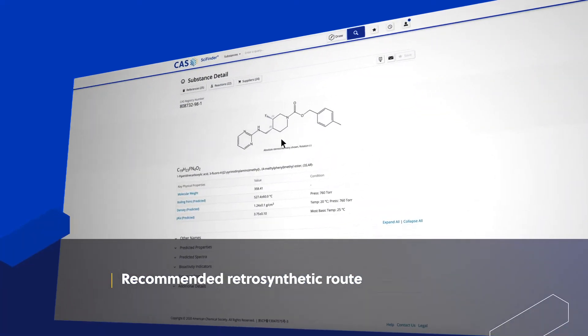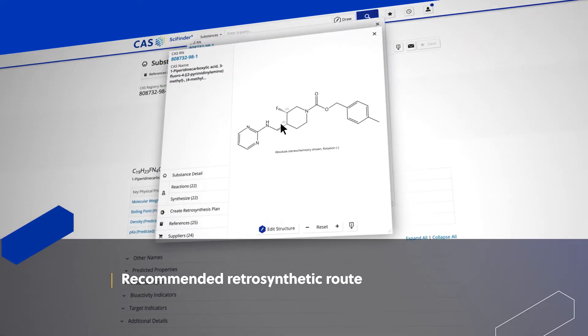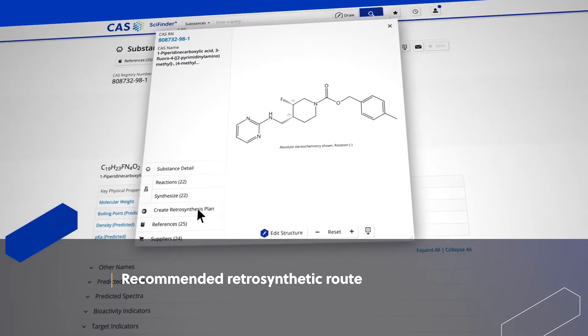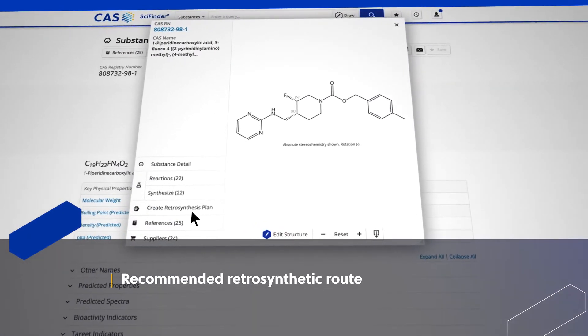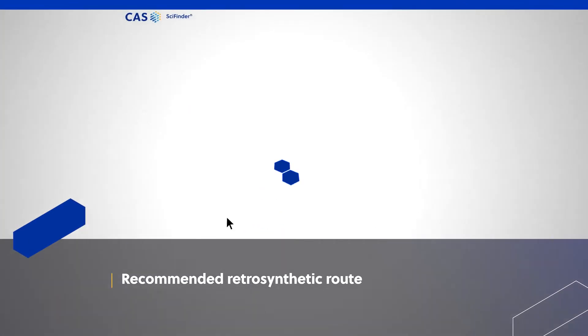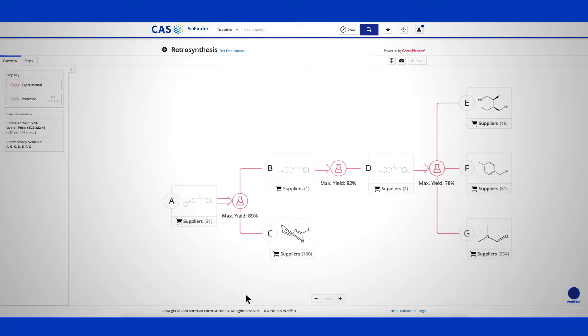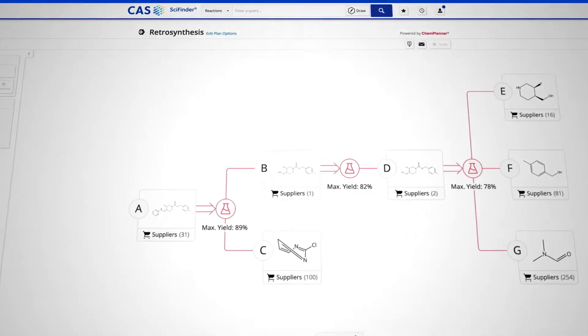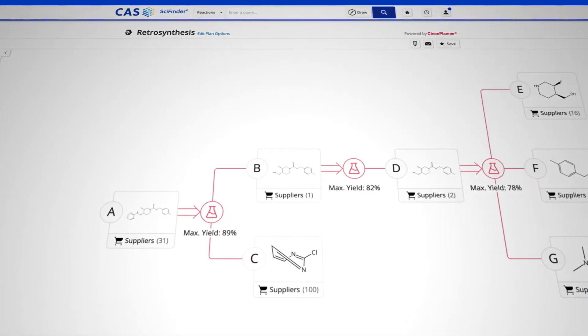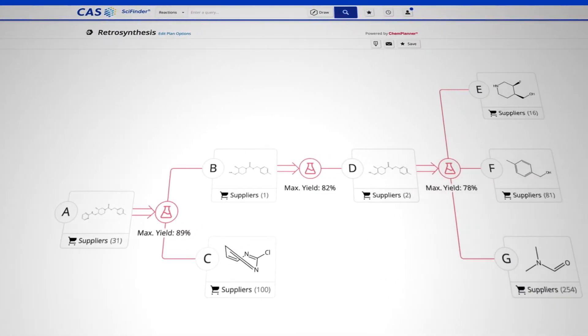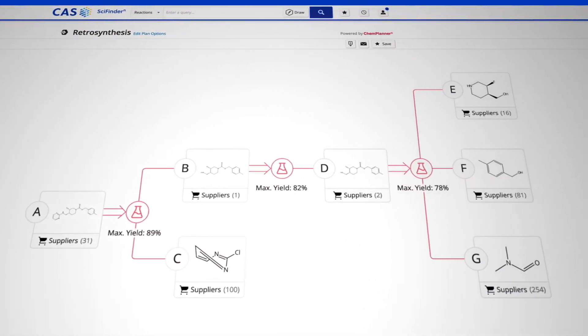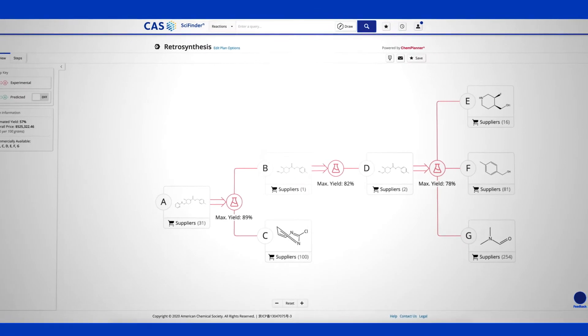SciFinder N identifies and displays a diverse set of plans for your target molecule, favoring steps that reduce complexity, exhibit synthetic efficiency, and lead to affordable starting materials.